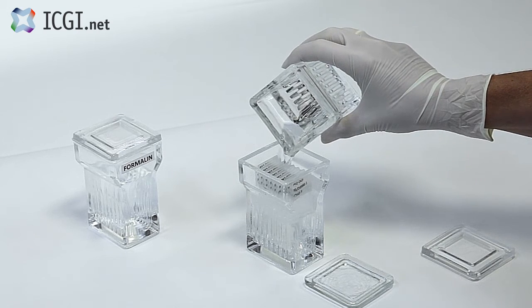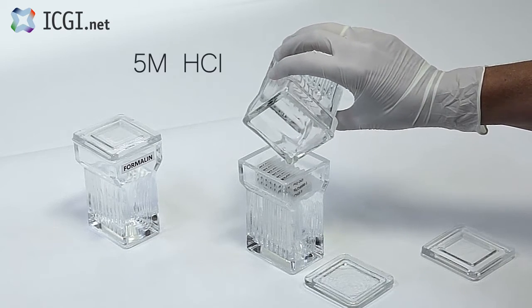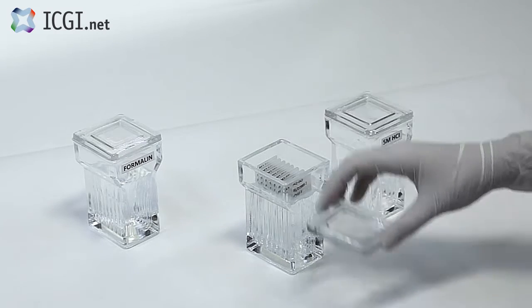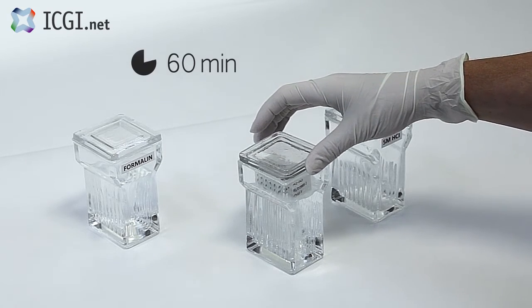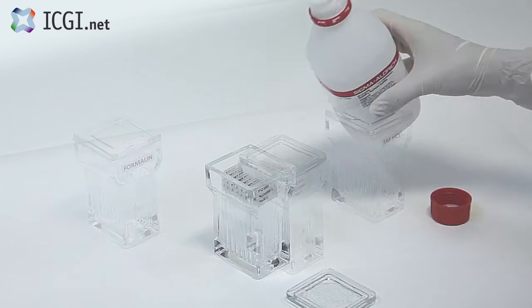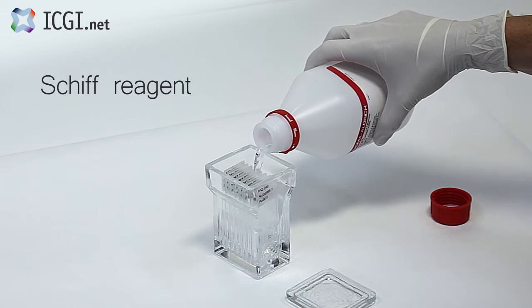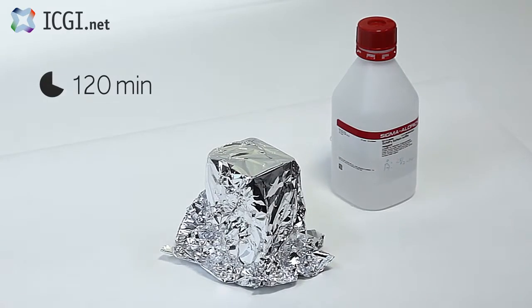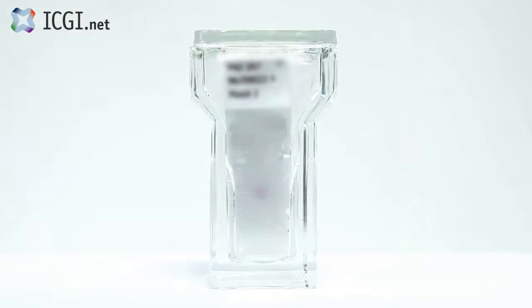The Feulgen staining process begins with hydrolysis using 5 molar of hydrochloric acid. The slides are left to bathe for 60 minutes at room temperature. During this process, DNA produces free aldehyde groups which can be detected by a color reaction. Subsequently, the free aldehyde groups are stained using the Schiff reagent. This is done for 2 hours, under dark conditions. The Schiff's reagent binds to the aldehyde groups in DNA, which results in a magenta color compound.